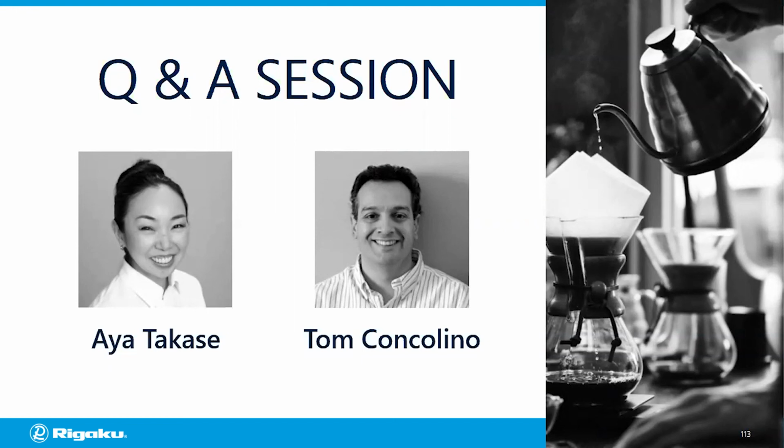Okay. All right. And we've got a question here from Ted, who unfortunately joined us late, and he missed the question of what special software we need to use to take advantage of the GD&T features. To do GD&T analysis, I would recommend VG Studio Max from Volume Graphics. As they claim, this is more or less the industry standard for GD&T analysis using X-ray CT.